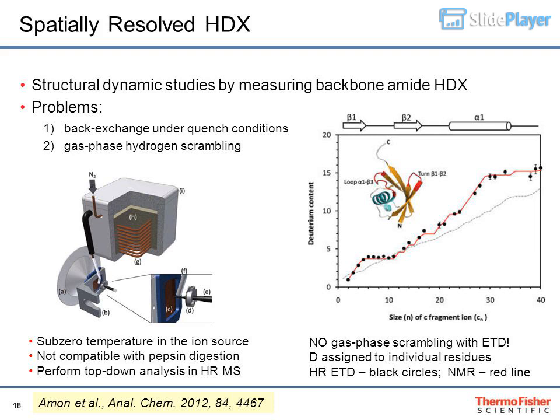The theoretical deuterium content in the case of 100% gas phase HD scrambling is indicated, dotted gray line. The inset displays the crystal structure of ubiquitin, PDB 1UBQ; the turn between beta strands 1 and 2 and the loop between the central alpha helix alpha 1 and beta strand are highlighted in red. See text for further information. Regions of secondary structure of the N-terminal half are illustrated above the figure for reference. A nearly perfect correlation is observed between the deuterium content of the c-ion series and the graph showing the cumulative deuterium content obtained from known NMR exchange rate constants 39. Compare filled circles with red graph in figure 4.